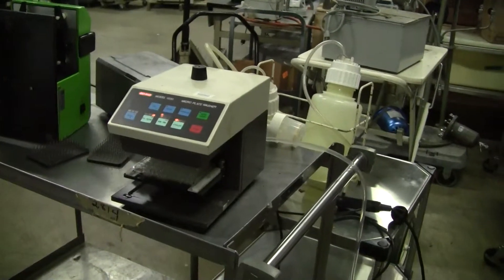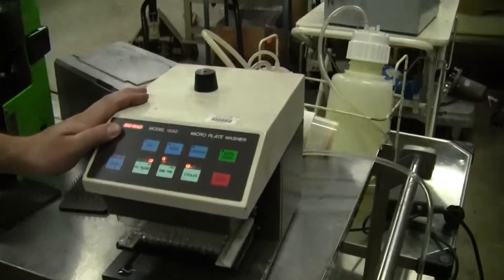Hi, this is Michael from Hi-Tech Trader. Today we're looking at a Bio-Rad model 1550 microplate washer.